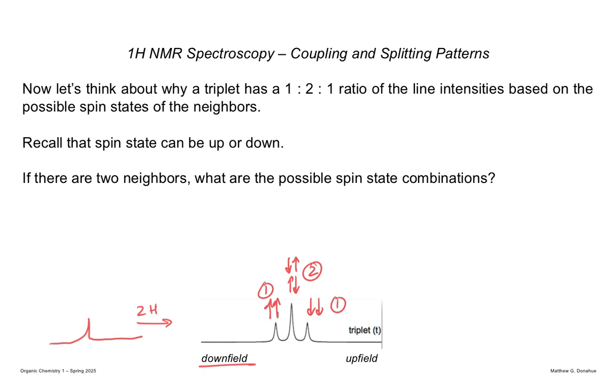And I said, see this distance here of these lines? You have 3 lines, and then you have these 2 distances. Those distances are the same. So from the center peak moving to the left or the center peak moving to the right, that's the same distance. So say, for example, from the center to the left, it's 5 hertz. Then from the center to the right, it also has to be 5. What is the reason for that?